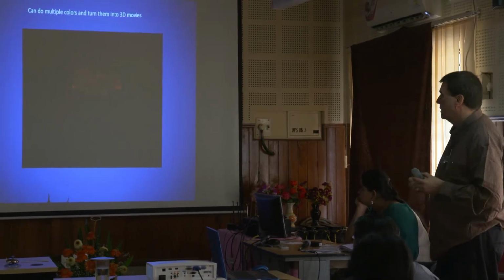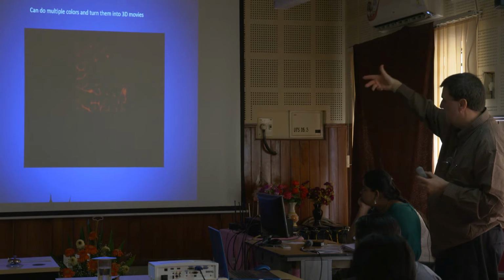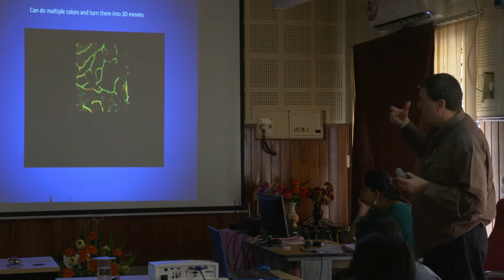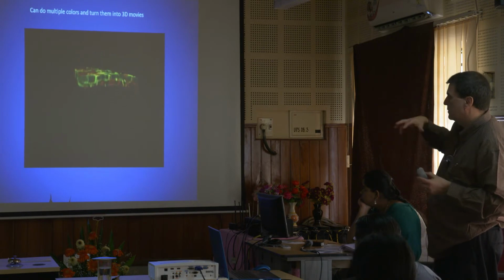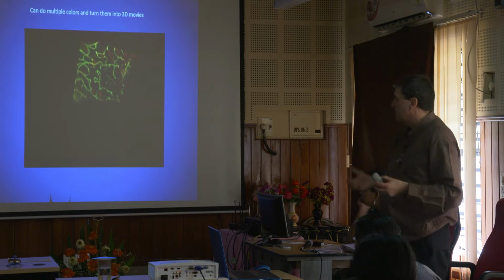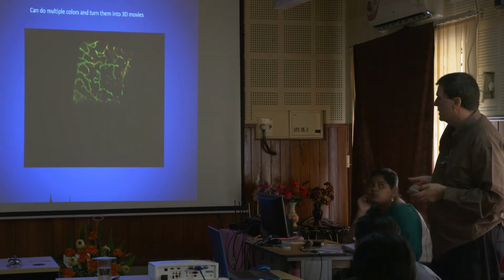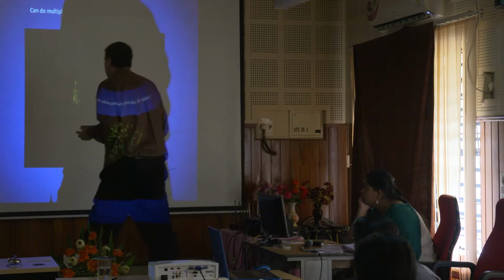I'm spinning around the retina here, looking at it from different angles in the red. Now I'm going to add my green in, which was a different molecule, and then I'm able to look at the relationship of both of them in 3D, how they relate to each other.